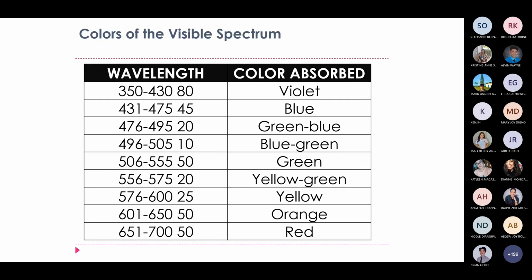Okay, so ito yung wavelength for violet, blue, green, blue. Pwede nyo din naman i-notes.